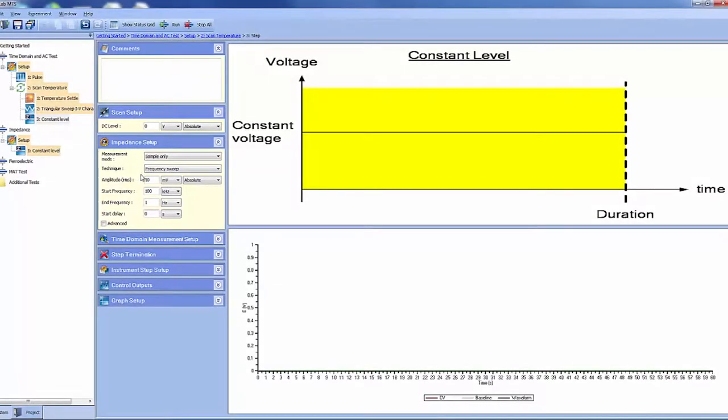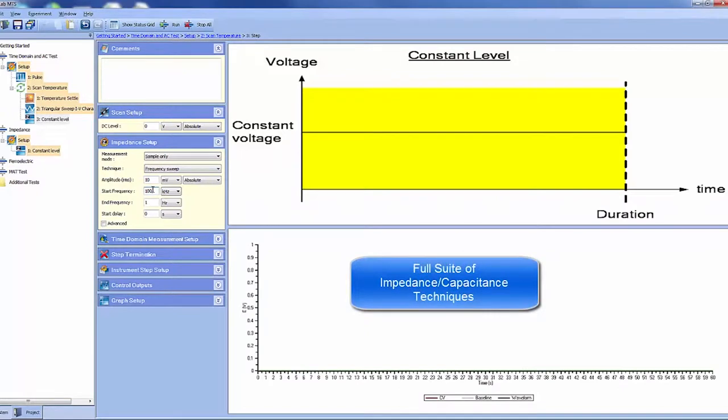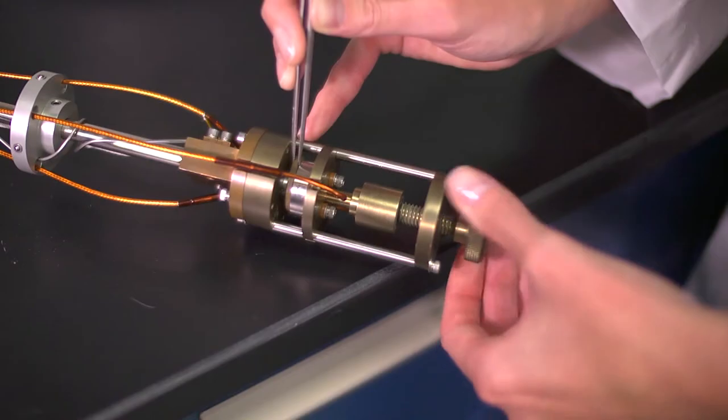Modulab XM software is a next generation approach in materials characterization software with an advanced user interface, data presentation and analysis. Modulab XM provides you with all the tools from the beginner to the advanced research scientist across a wide range of applications and techniques.